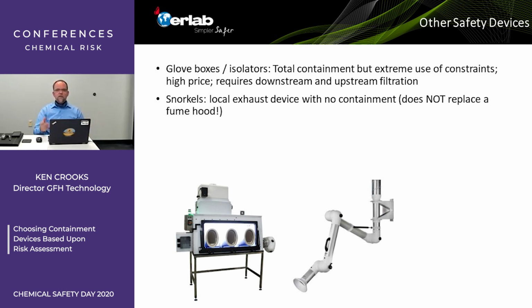I recommend these for spot capture of heat, or again, nuisance odors that are not a hazard, that are well below your threshold limit value, your exposure. It's just nuisance. Oh, I don't like that smell, but it's not going to harm me. These absolutely do not replace a chemical fume hood. I've unfortunately seen some installations where a snorkel was used because they couldn't fit a fume hood and they thought, well, that's good enough, and it's not.